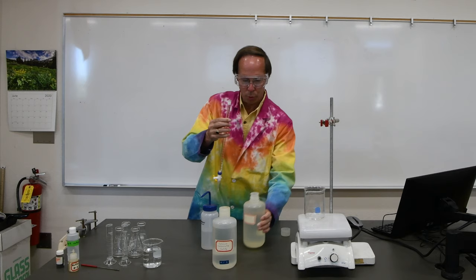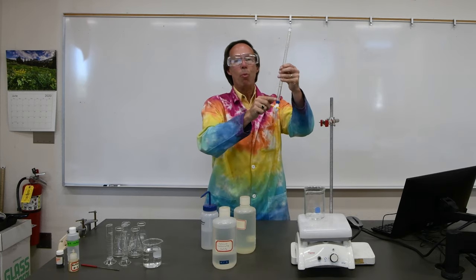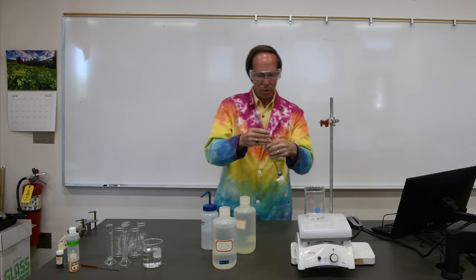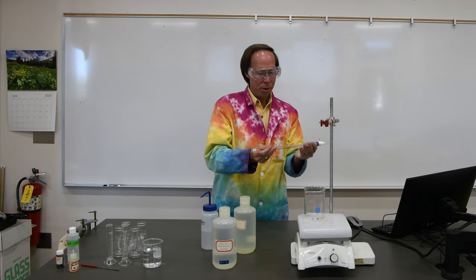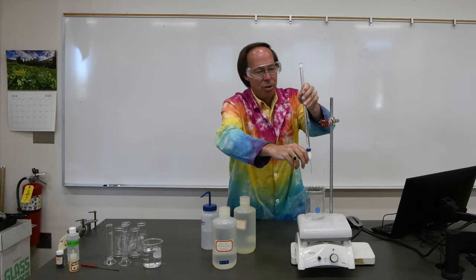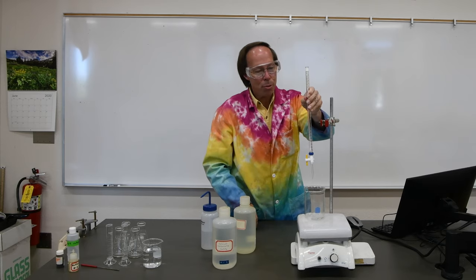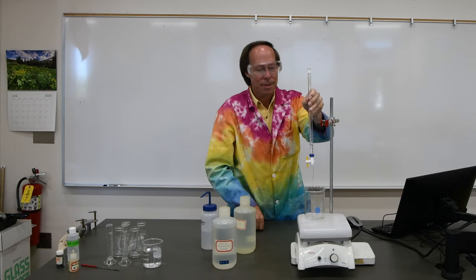Now the problem, of course, is as soon as we added that EDTA, there was still some water in here, and it diluted the EDTA, messed up our concentration. So I'm going to swirl this around a bit to try to get any water out of there, and then we'll let this drain out. So this should push any of the water that was left in the burette out the bottom. We want to make sure there's nothing inside this burette but the EDTA.